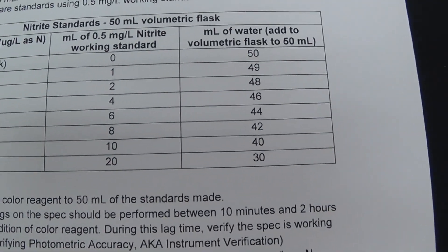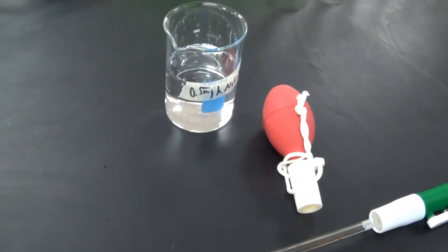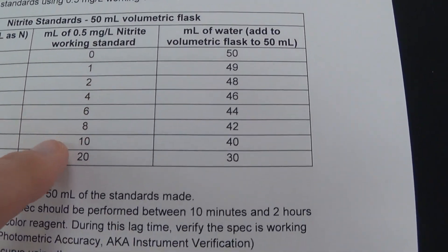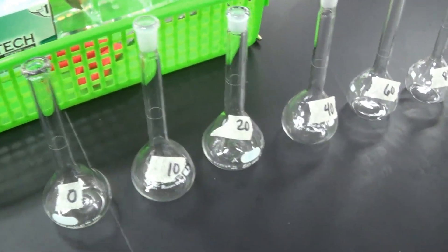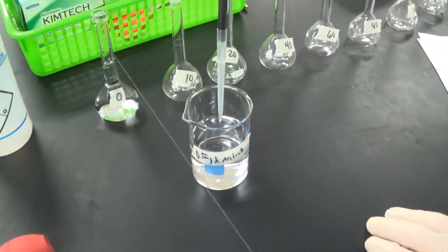Next we're going to make the standards. We're going to take what was just made and use a certain number of mLs of that and dilute it up to 50 mLs in these 50 mL volumetric flasks. There we go, we're going to start making our standards.